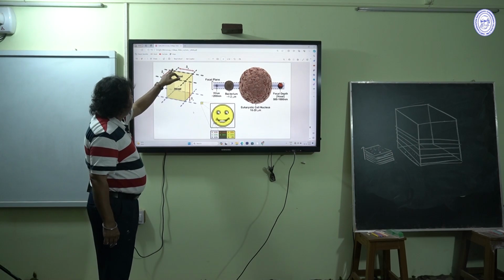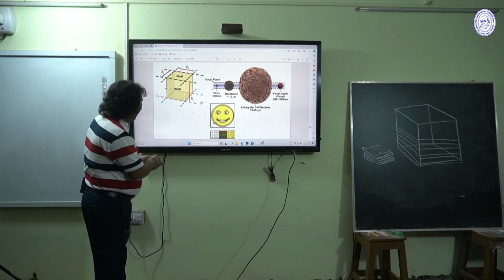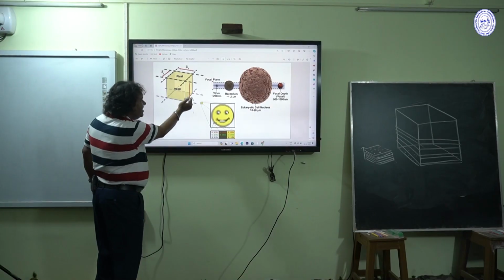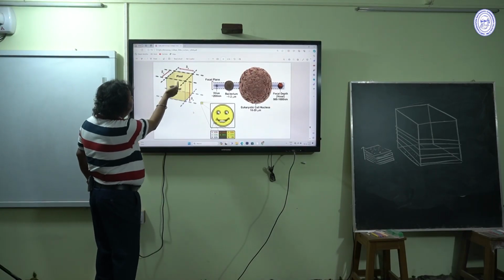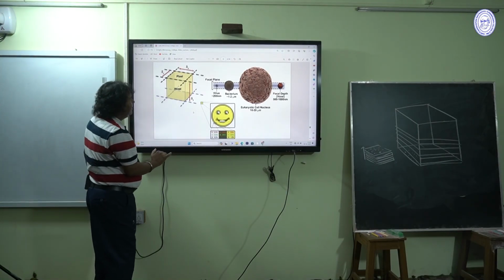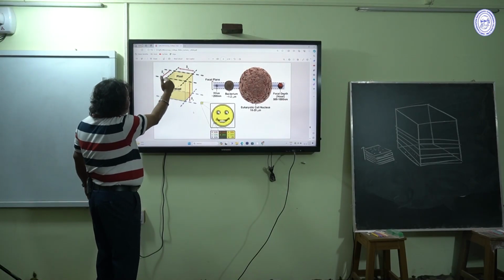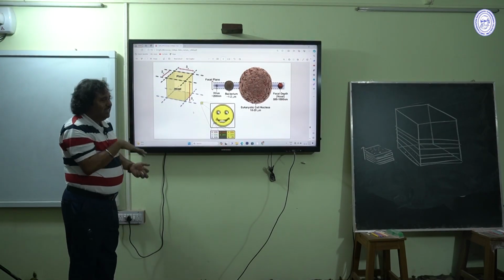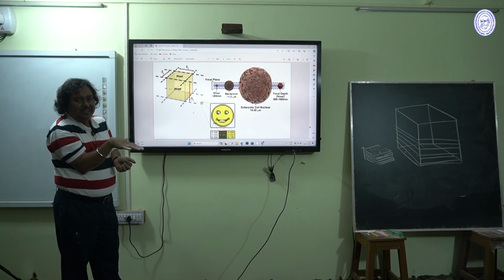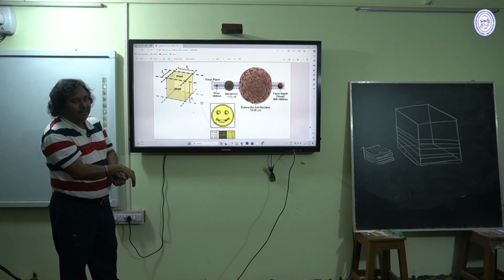This is X and Y, simply known as pixel, and it is Z. So the X and Y axis here, so many imaginary layers may be present. If the XY pixels in each layer are the same, then the voxel will be isotropic.